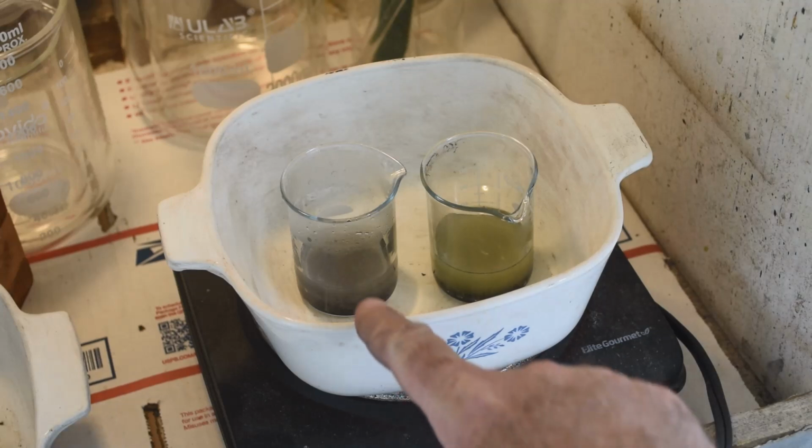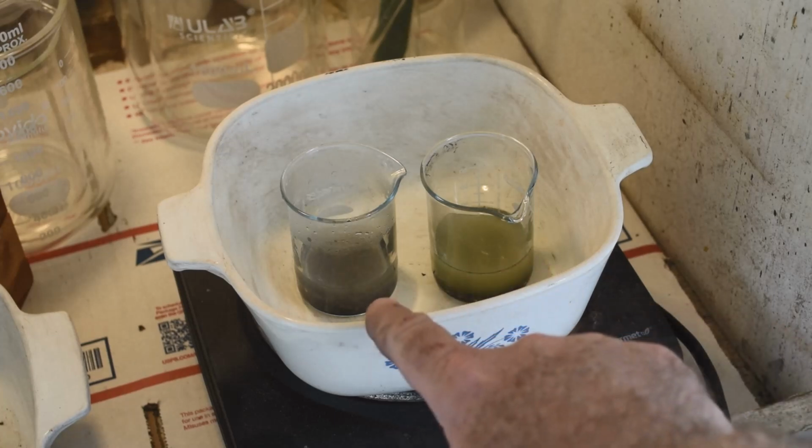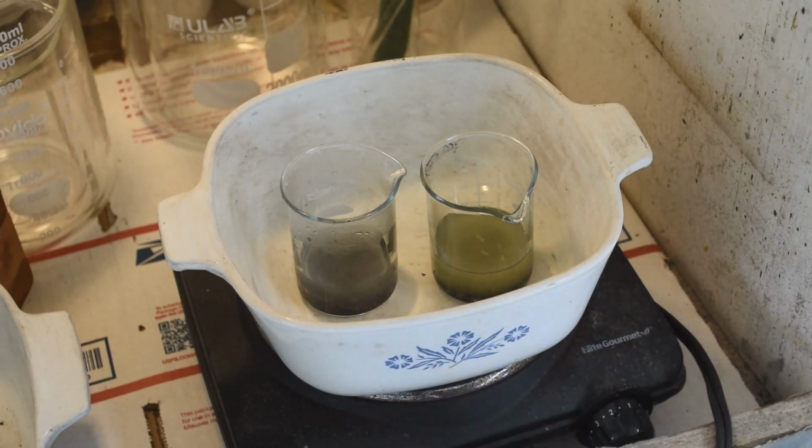So what I've got going on here is two beakers with roughly equal amounts of the material in them. This one has hydrochloric acid on it, and this one has sulfuric acid on it. I'm trying to figure out which one is going to do a better job of dissolving the iron out of there. Now both of them should leave the silver alone. Certainly the hydrochloric acid will leave the silver alone. It'll get passivated with a coating of silver chloride, and that'll be the end of it.